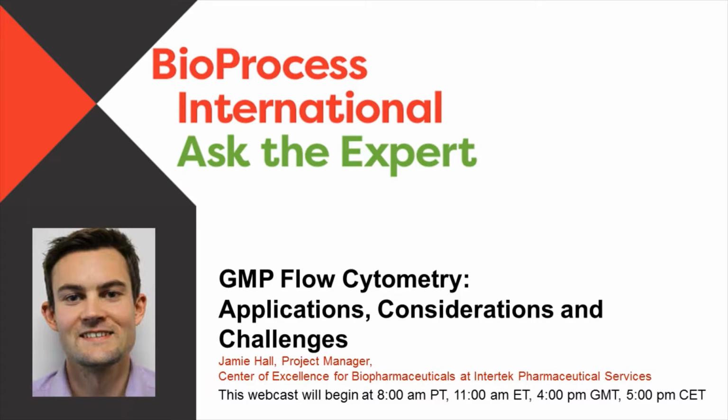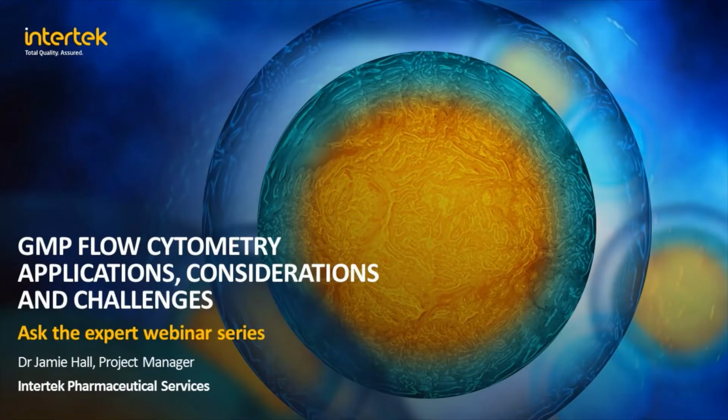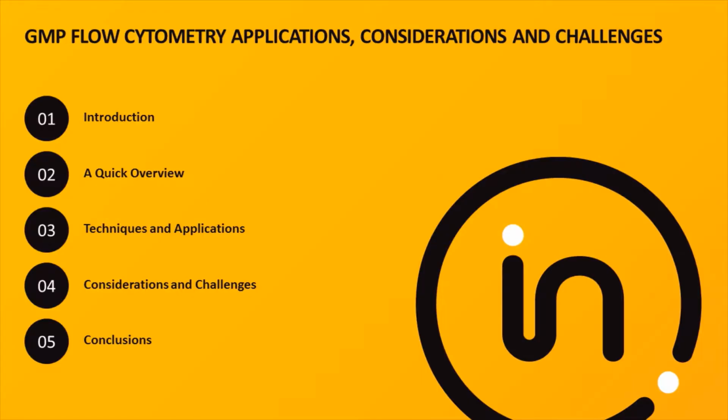Hi, thank you very much. So in this presentation, I'm going to delve into the wonderful world of flow cytometry and explore how we can harness this powerful technique in the regulatory environment. First, I'm going to give you a brief introduction to Intertek and then go into the workings of the flow cytometer itself, before I take a look at the applications and some of the challenges such a versatile system can present.